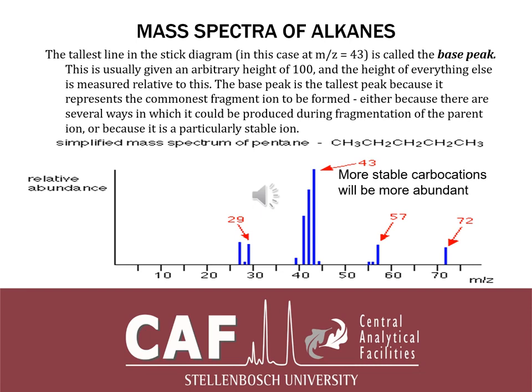So there are two to three carbons where the carbocation, the positive ion, can be stabilized and rearranged. That is why the highest peak will be coming from that fragment, because of the stability, because of more places where the positive ion can be stabilized. That's why they call it a carbocation.